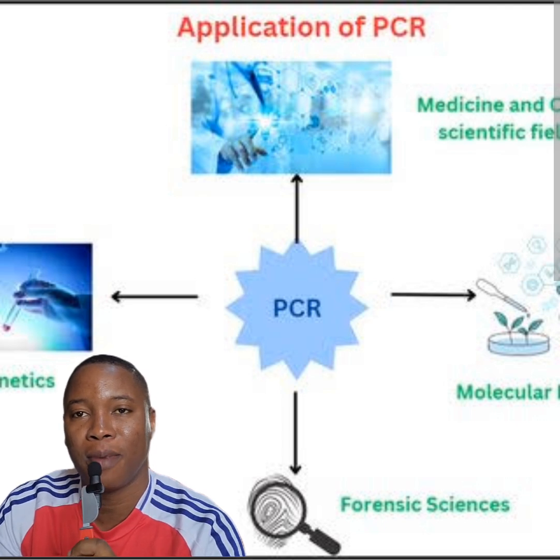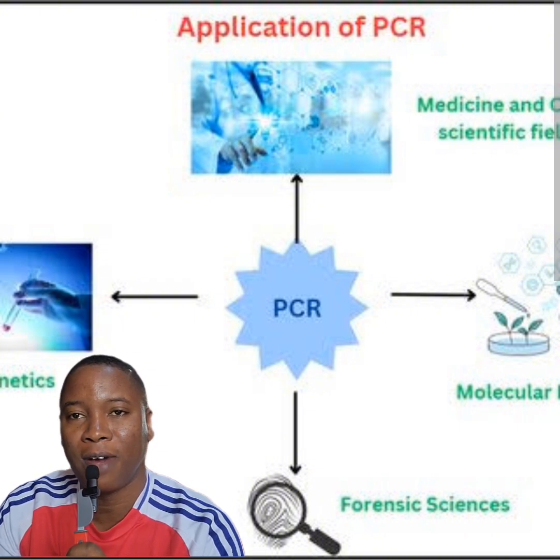We have been discussing PCR, polymerase chain reaction, and we'll continue our discourse by looking at exactly what the effectiveness of this technique is. Like we said in an earlier video, which you can check on any of our platforms, PCR is a laboratory technique where we try to amplify, make many copies of, a section along the length of a DNA. And there are many reasons for doing this.